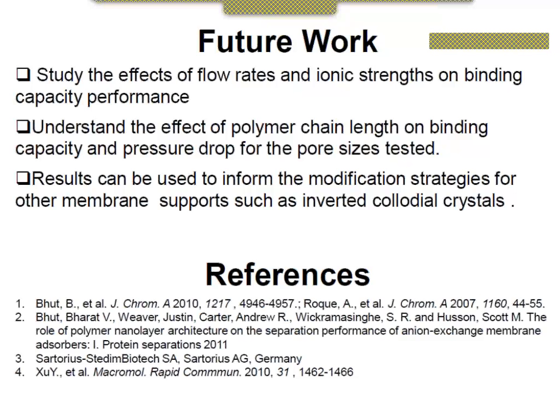The first question is for Ebony. It seems like more chains are desired for higher binding capacities, but could long chains cause a higher pressure drop? And which pore size would you expect to be most affected by that?